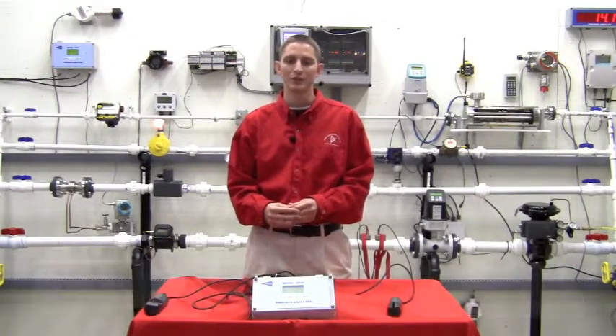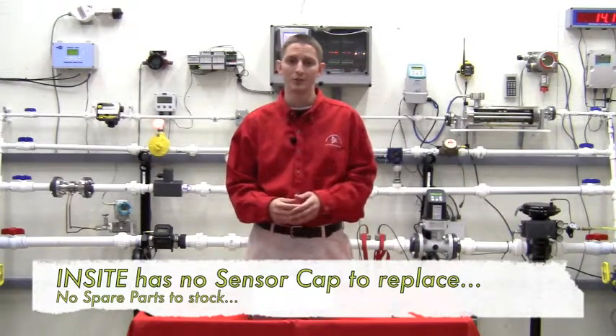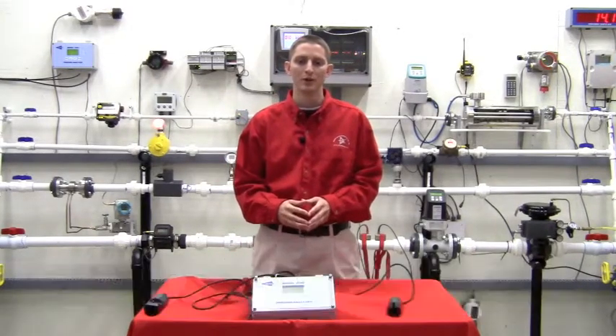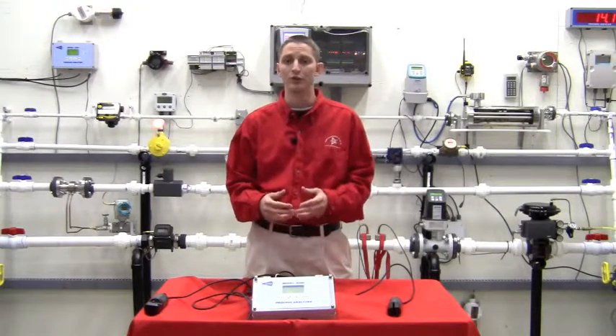Most of the competition's sensor caps cost about $150 to replace, so you will typically save around $1,000 on spare parts over the lifetime of a sensor. Our sensors have no consumables or replacement parts, while many of our competitors have threaded-on sensor caps, which we do not require.